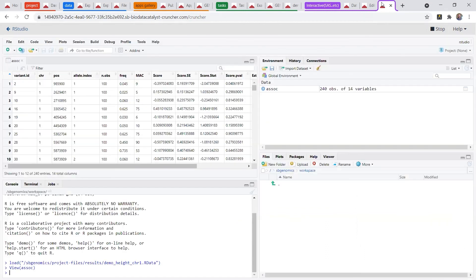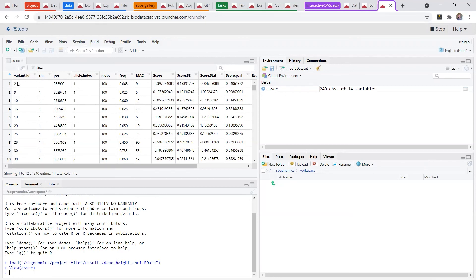RStudio is another option, of course. So in particular, the Genesis workflows, those are outputting R data files, which you can open up in RStudio, make plots, and save them back to your project. So that was a quick tour.